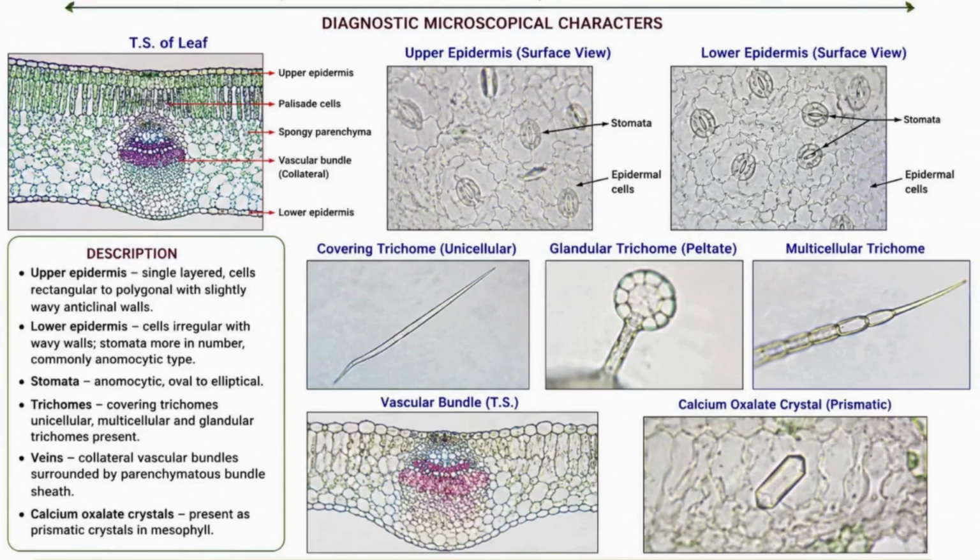So, I hope you all have understood the morphological and microscopical evaluation of Tulsi leaves and the important diagnostic characters used for their identification and authentication.